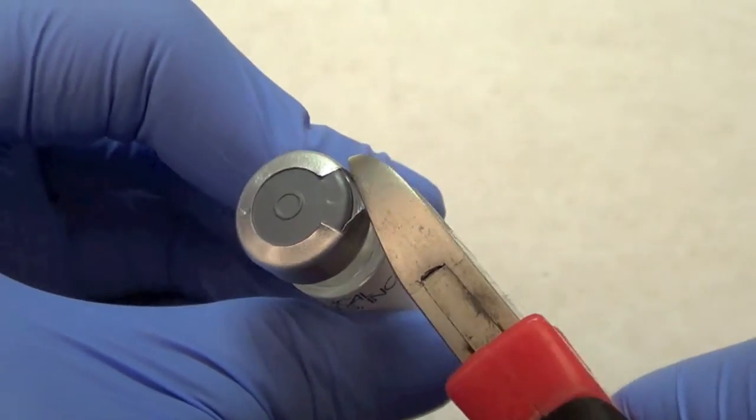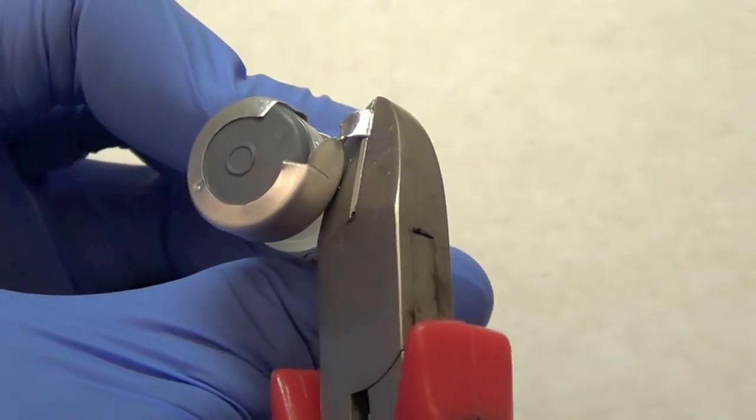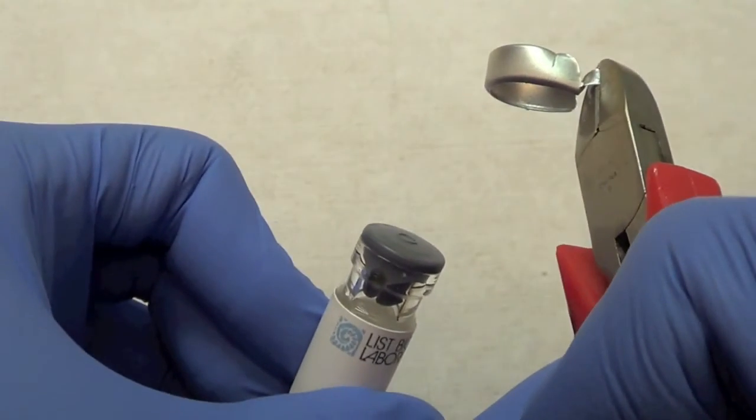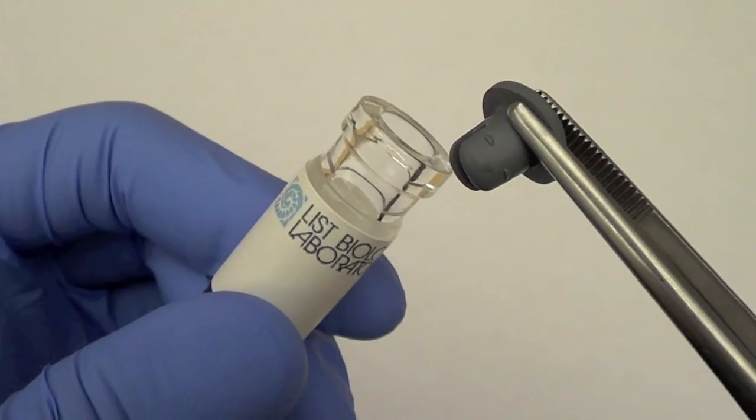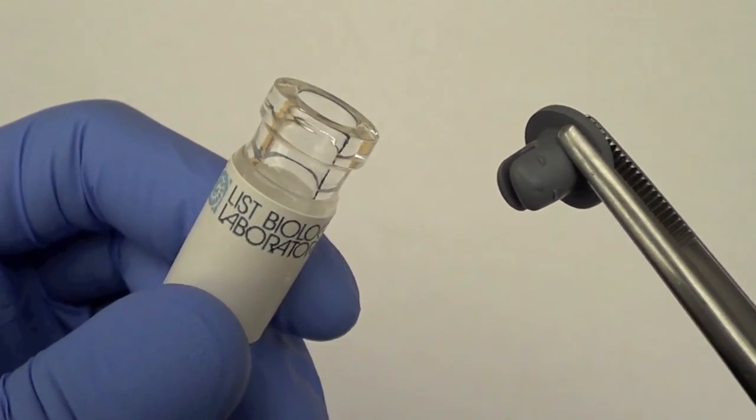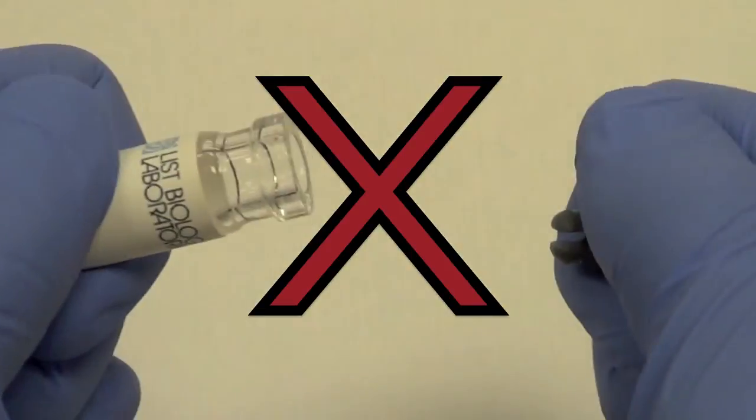Gently continue pulling the tab until the crimped metal seal is broken. Remove the metal seal. Use forceps or equivalent tools to slowly and gently lift and remove the rubber cap. Please don't use your fingers or any excessive force.